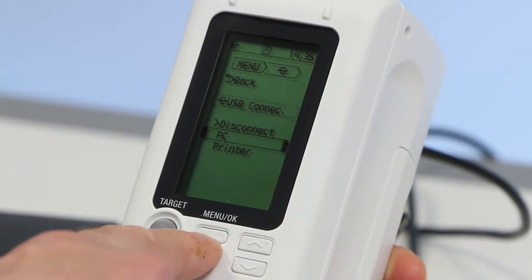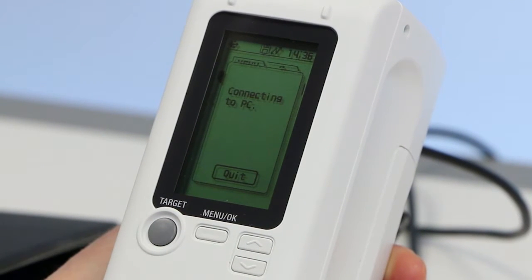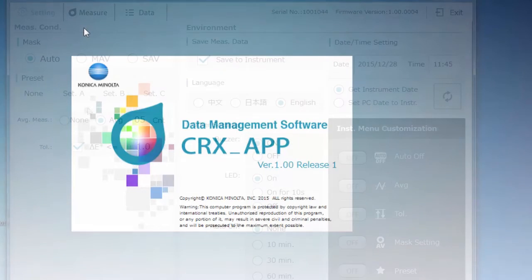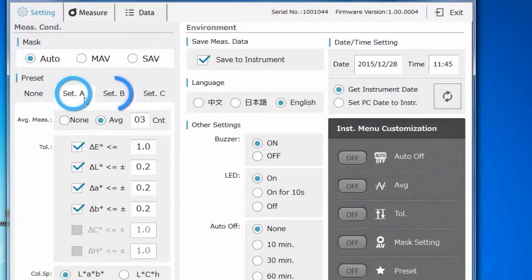To set up custom pass and fail judgments, first connect the instrument to a PC. Then, enter three separate tolerance settings in the included utility software. These settings will highlight your out-of-tolerance sample readings.